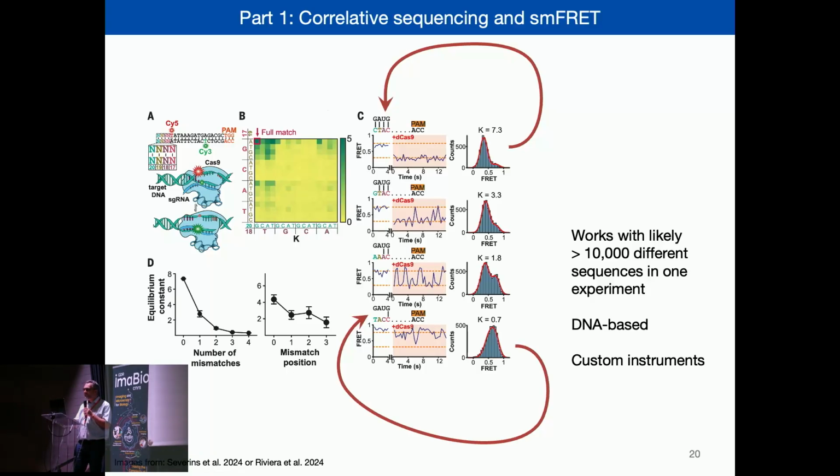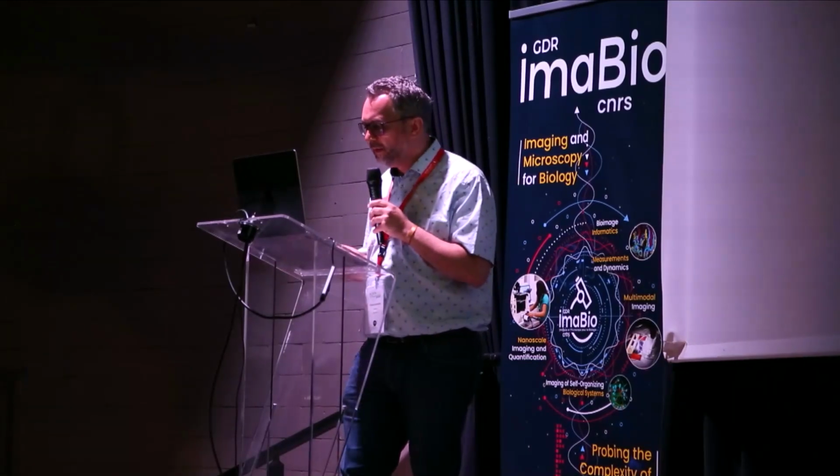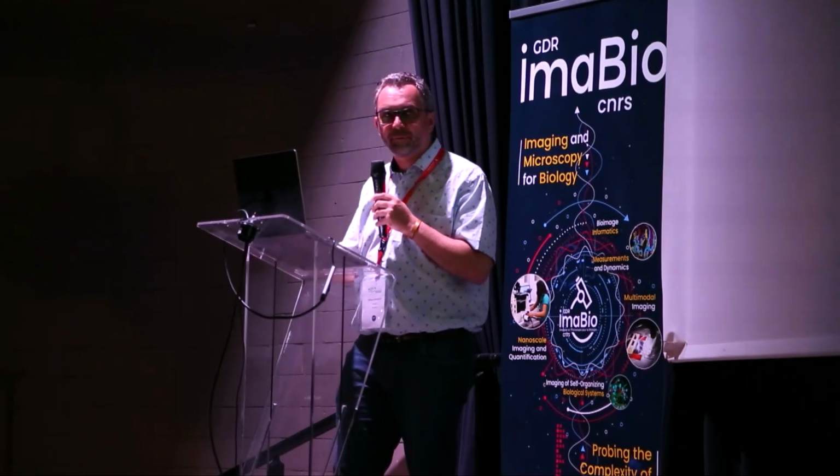So now, over the next 10 minutes, I would like to talk a little bit about our development in the direction of high throughput single molecule FRET experiments. And this basically uses multi-parameter fluorescence and time-correlated single photon counting. But the big question that we have here is why did we actually develop this high throughput single molecule FRET workflow? And I would like to give you a little bit of background there.